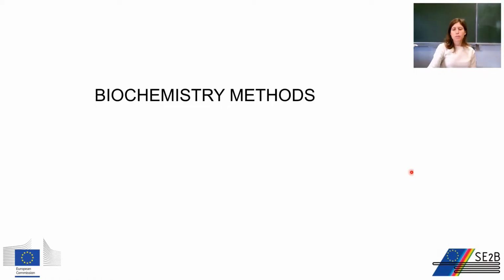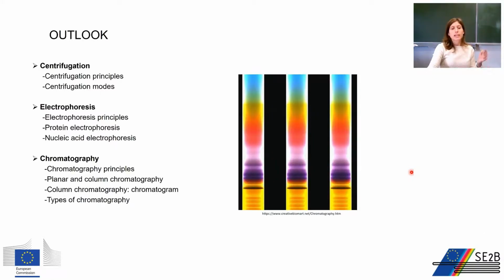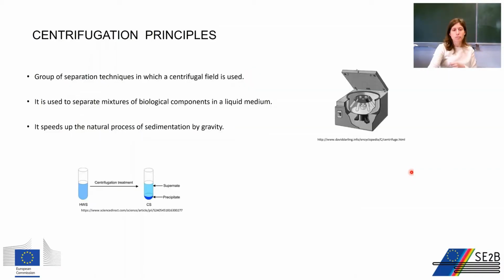Welcome to the video on biochemistry methods. In this video, we will learn about centrifugation, electrophoresis, and chromatography.